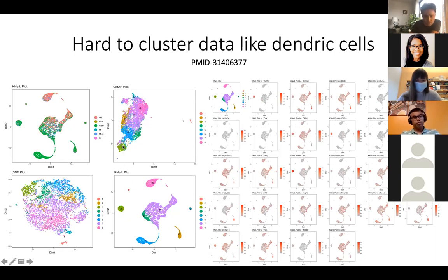So in this one, cluster number 3 is easily found here. Again, cluster 2 is in the corner here, but it can't be found in a separate distinction here. Cluster 1 is easy, that comes clear in UMAP and tSNE too. But then again, you have 8, 7, and 6. It's more clear in here than 8, 7, and 6 in here. So this is in fact dendritic cell data, I guess.